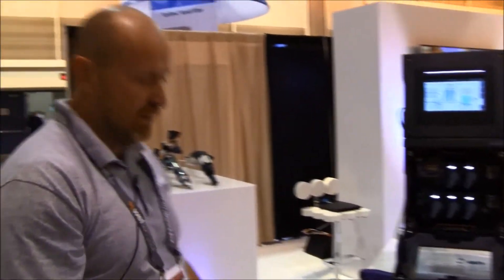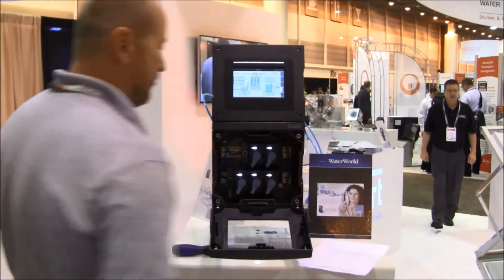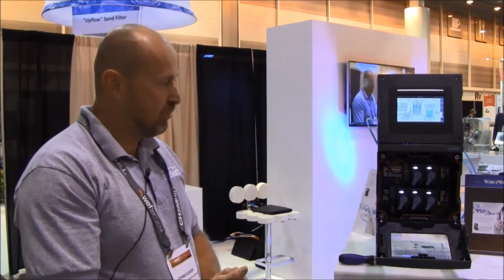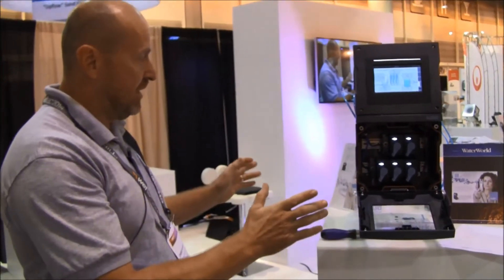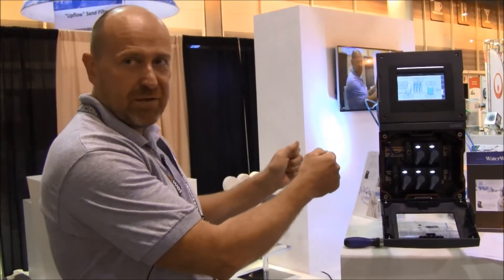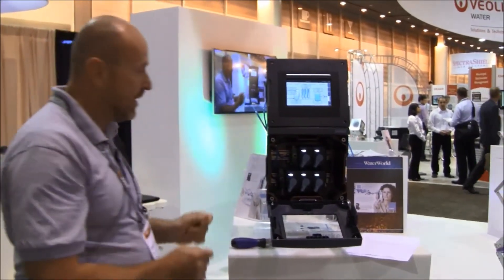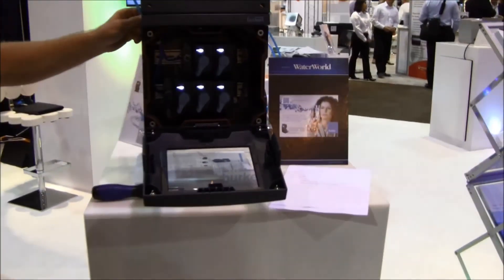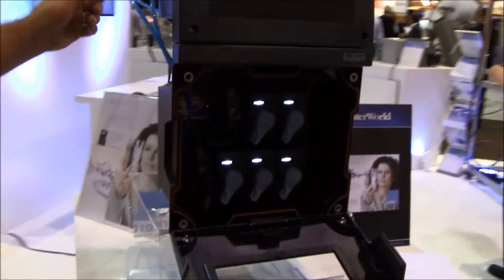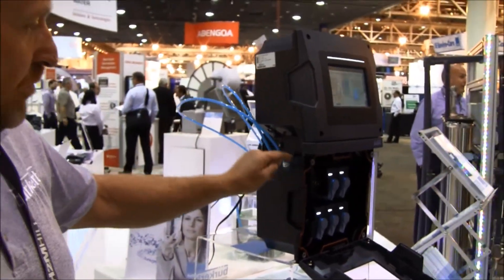Let's talk a little bit about installation. Installation is quite easy. The first step is to use your stainless steel holder — mount the stainless steel holder to the wall. Then you take this box, just plug it into the wall, and you are done. Next, you need to connect the samples you want to measure. You just take a piece of tube coming from the main process going into a bypass, and put it in.